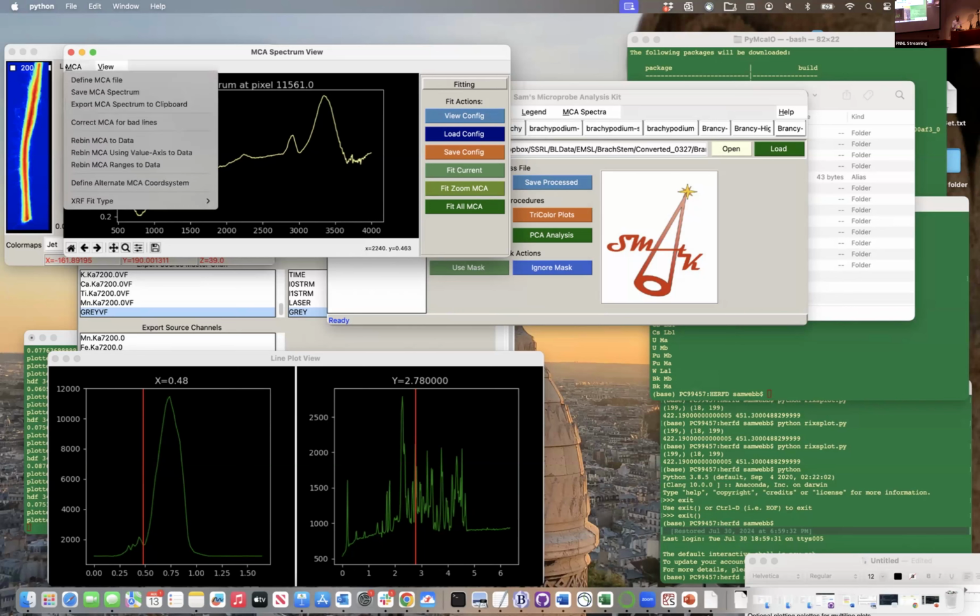And we can do things like rebinning data. This is going to rebin it with bins. I can use the value axis, that spectrum axis using wave numbers. If I'm really lazy, I can say bin every 20 wave numbers through the whole data set and give me not specific bins, but a rough bin of all my data.